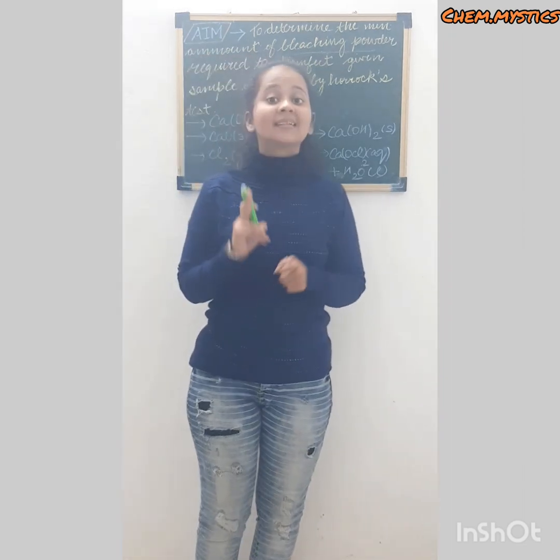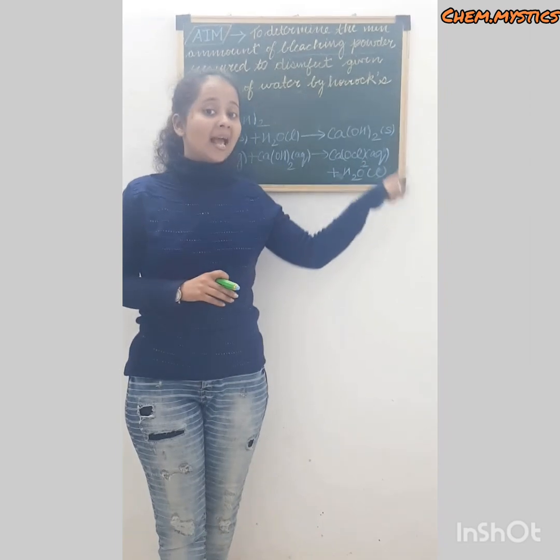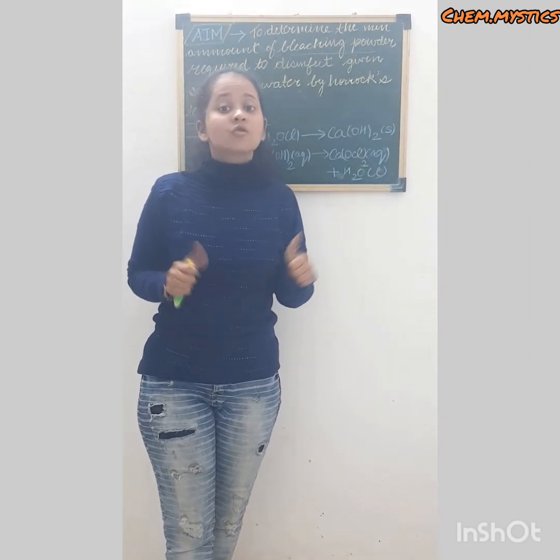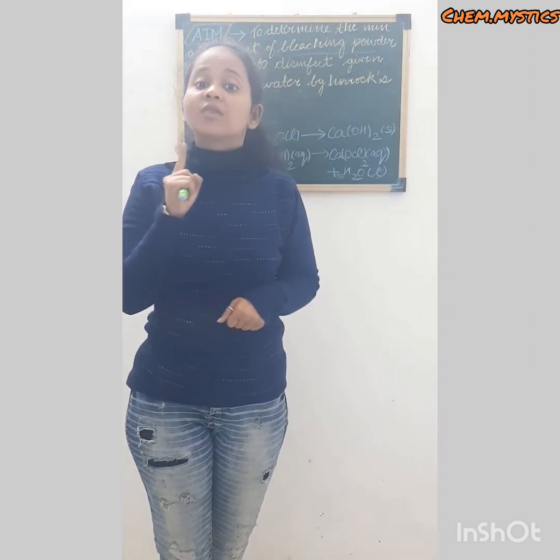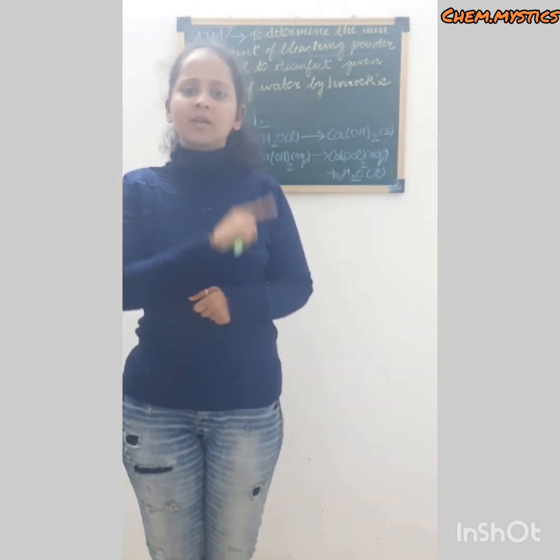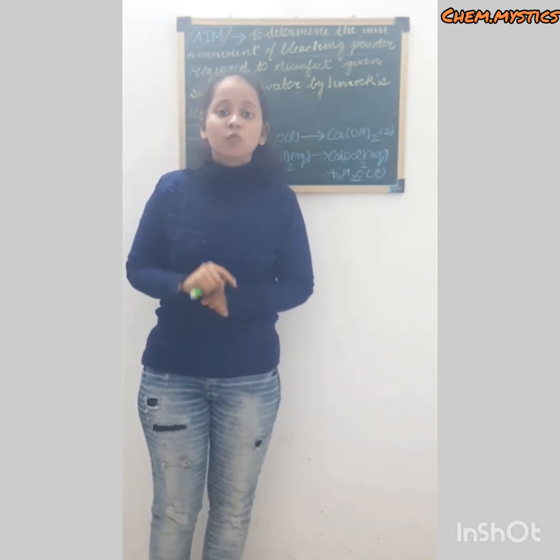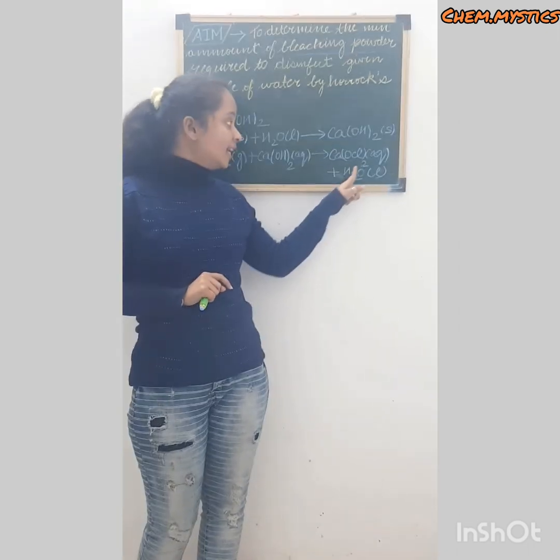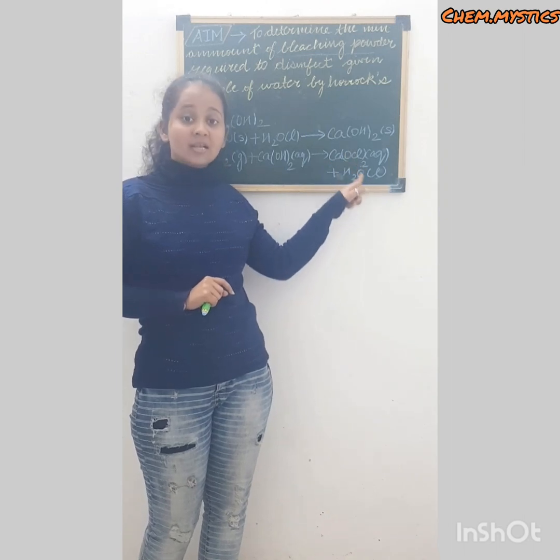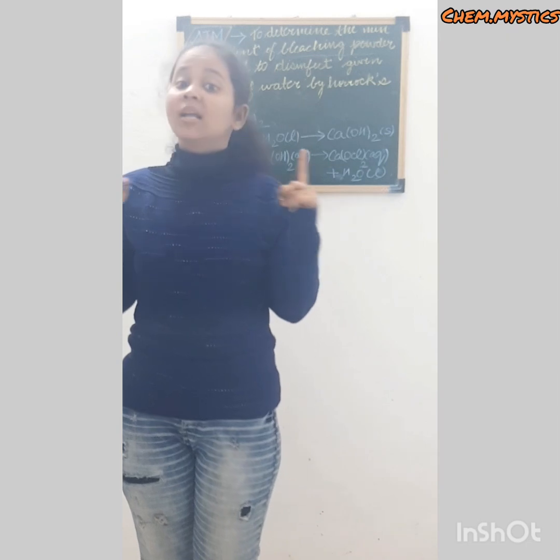So yes, bleaching powder is synthesized and it is ready to act as a disinfectant. And now guys, this question must be striking in your mind: how does this bleaching powder act as a disinfectant? So you need not worry guys, because I am going to answer your question right now. Point to be noted guys, chlorine is the main content of bleaching powder. Chlorine present in this bleaching powder is responsible for disinfection of water. Then how? Listen guys.